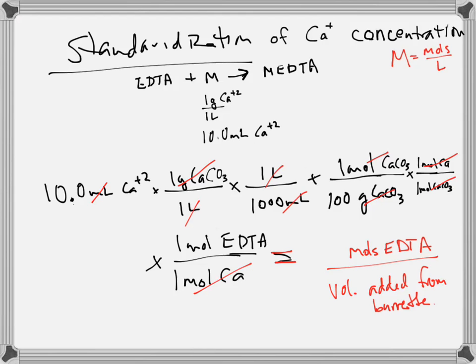Okay? What should this number come out darn close to? Some of you are flipping back through. It's a good sign. 0.004 molar. That's what we were trying to make at the very beginning. Okay? This now tells us a much more accurate concentration of the EDTA solution. We're going to end up with, I think, 4 sig figs in this calculation. Not a big sig fig stickler, but don't remove too many in this experiment. Okay?